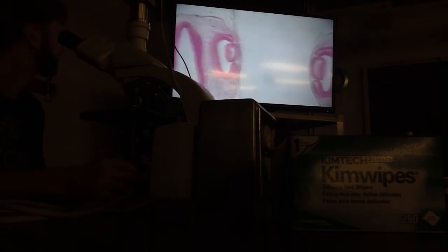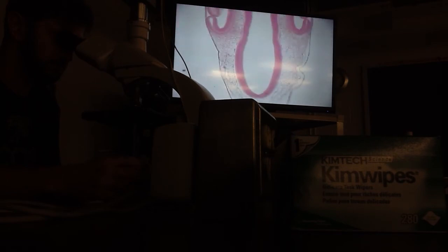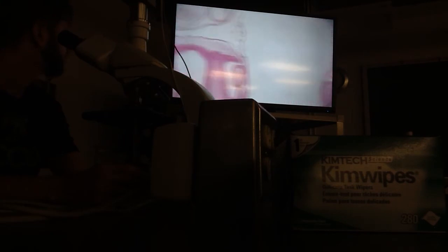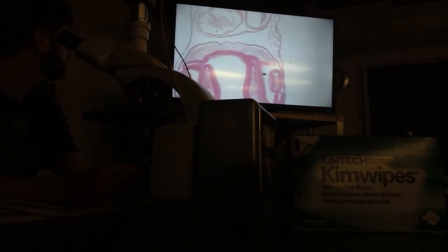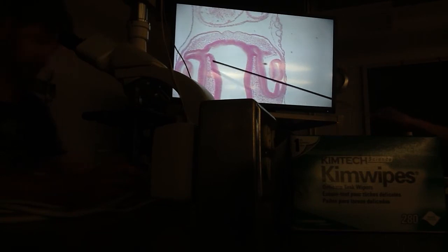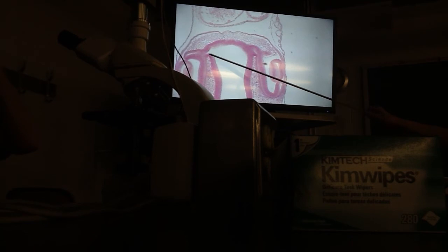One more. Oh, you missed something I wanted to show you. We'll get it. So can we not see the mesencephalon anymore then? We're past the mesencephalon. Stop. This is without question eye, correct? Yes. Here's the stalk that leads to the brain. This is without question diencephalon. So by patterning, you can answer all of our questions.